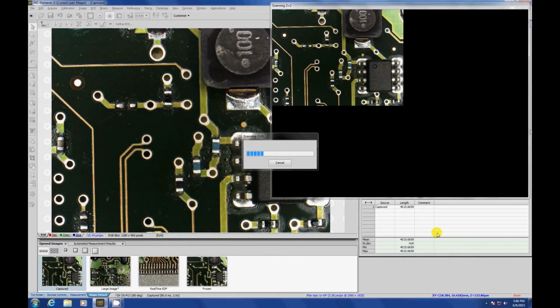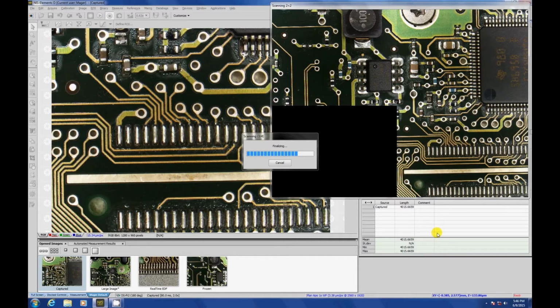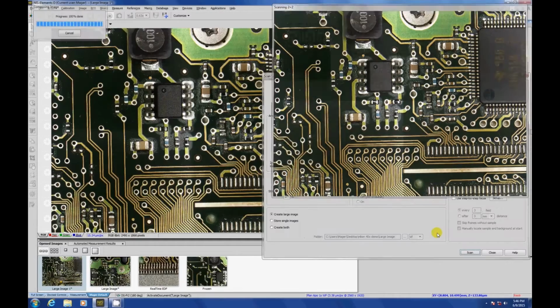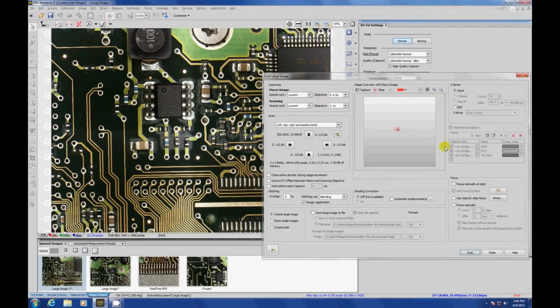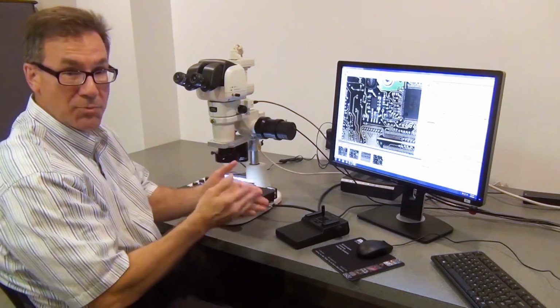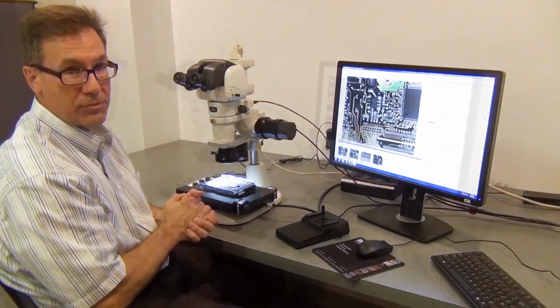And as you can see, it's going to create, in this situation, for that area I wanted to capture, about a 2x2 image. It creates the thumbnails in the top right, captures these 4 images, and then at the end goes ahead and stitches those images into one large image, which can be saved just as a simple image. I can do measurements, put scale bars on, and that is the benefit of the XY motorized stage.